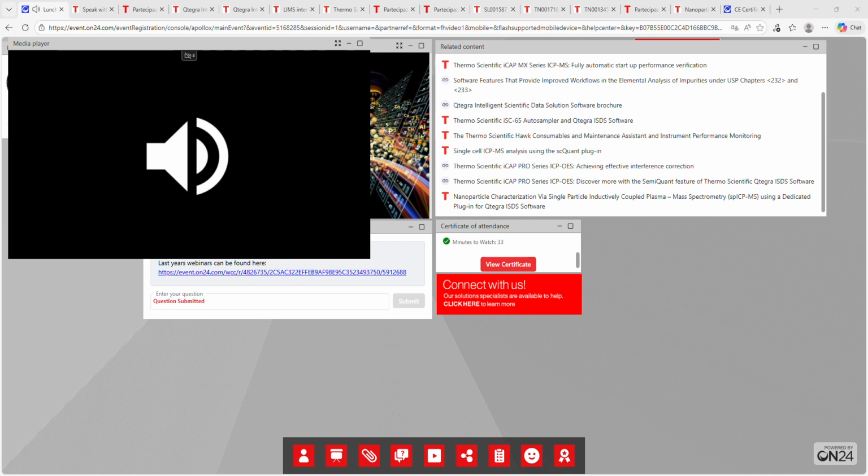Okay, so I assume we're talking about an ICP OES here. In reality, it doesn't really matter how many elements you have. It's a simultaneous system. So whether you're running 1 element or 30 elements, the time is the same. Again, it depends on what limits of detection you're looking for and what instrument you're using. So if you've got an iCAP PRO XP and you can go down to 5 seconds, then 5 seconds exposure time won't give us the absolute best limits of detection, but it gives us pretty decent data. So if that's workable and gives you the limits of detection you need, then 5 seconds is fine.